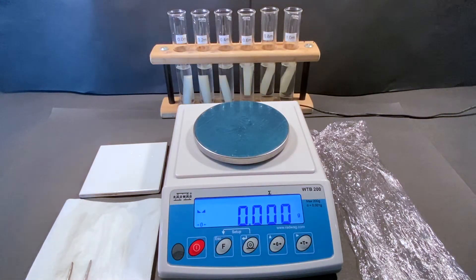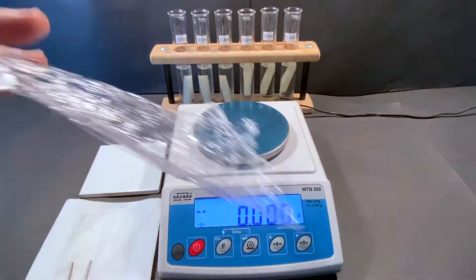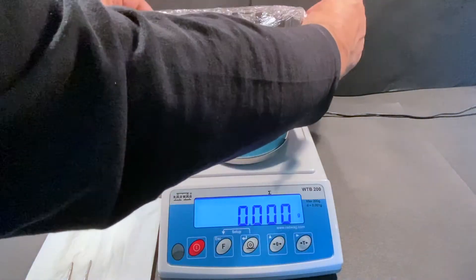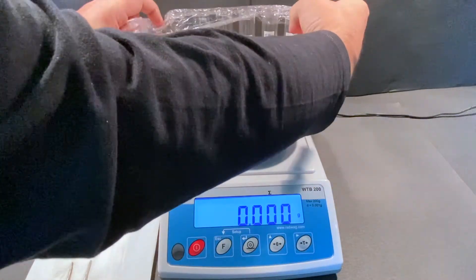Cover the boiling tubes containing the samples with the cling film provided. This will prevent any evaporation of the sucrose solutions and any contamination that may enter the tubes.